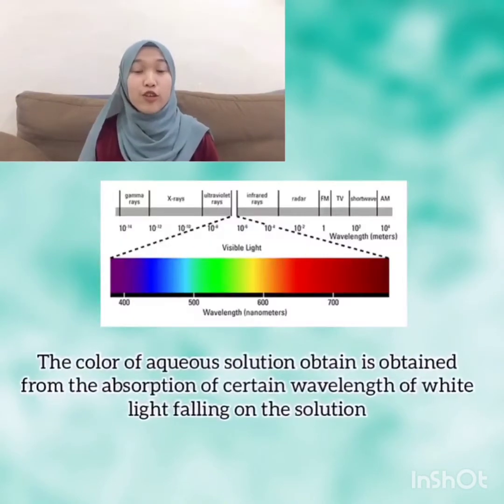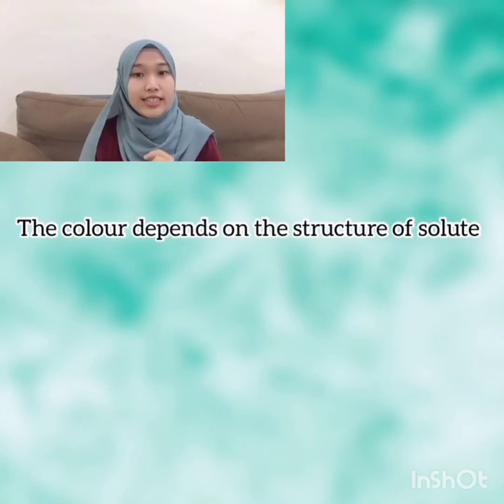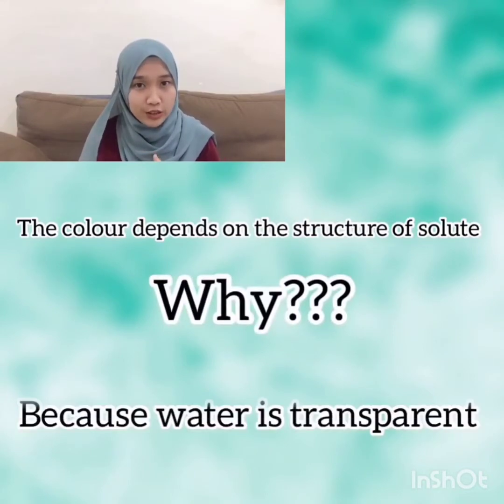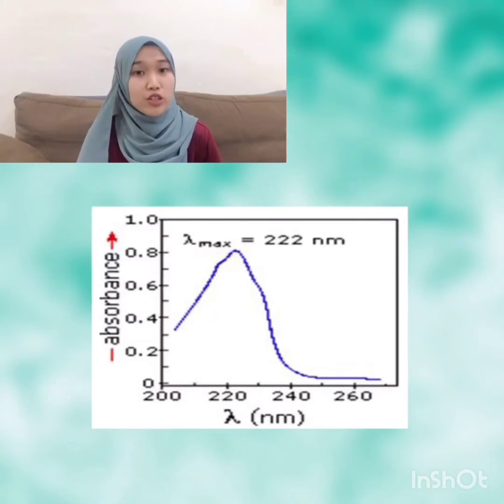The color of aqueous solutions results from the absorption of certain wavelengths of white light falling on the solutions. The color depends on the structure of the solute, as water is transparent. The wavelength of maximum absorption is designated as lambda max.